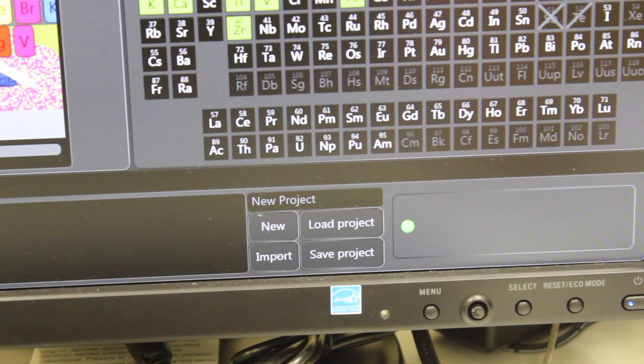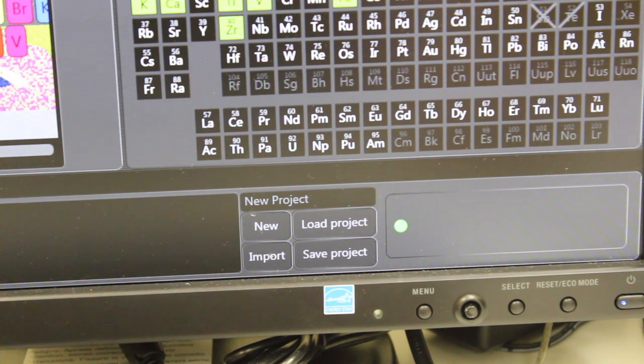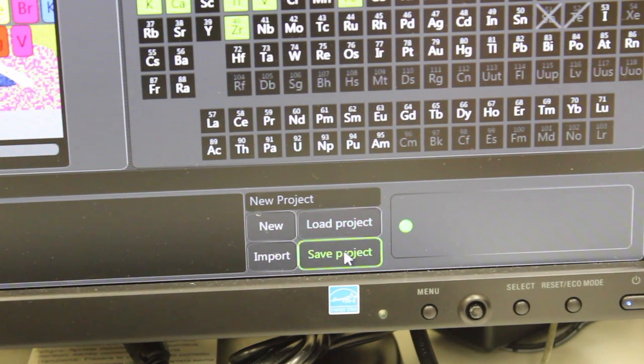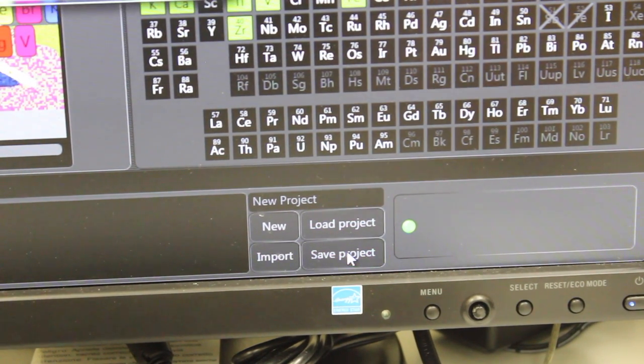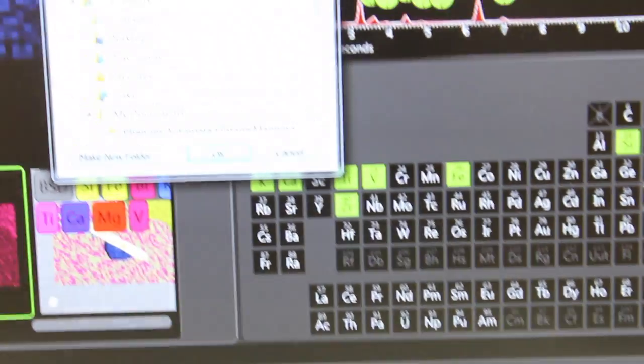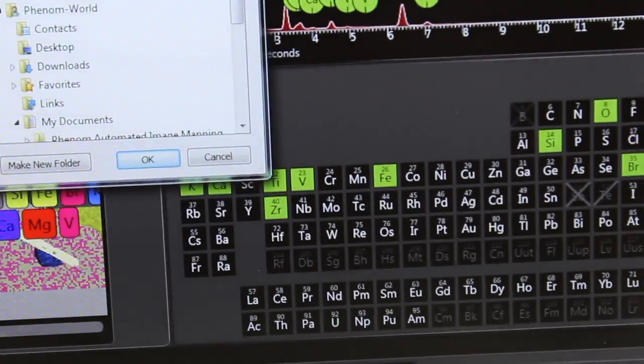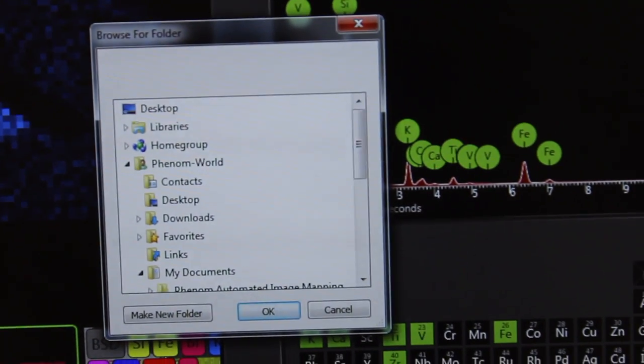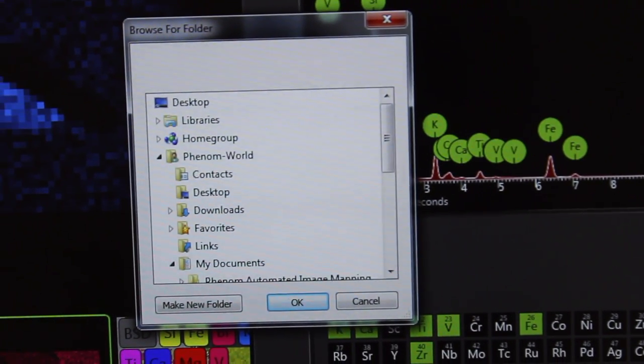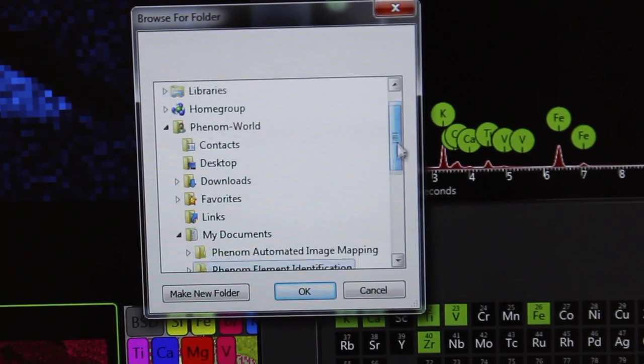To save your data, make sure that you go to the bottom of the screen and click Save Project, and then it will bring up a window here that will allow you to choose where to save your project.